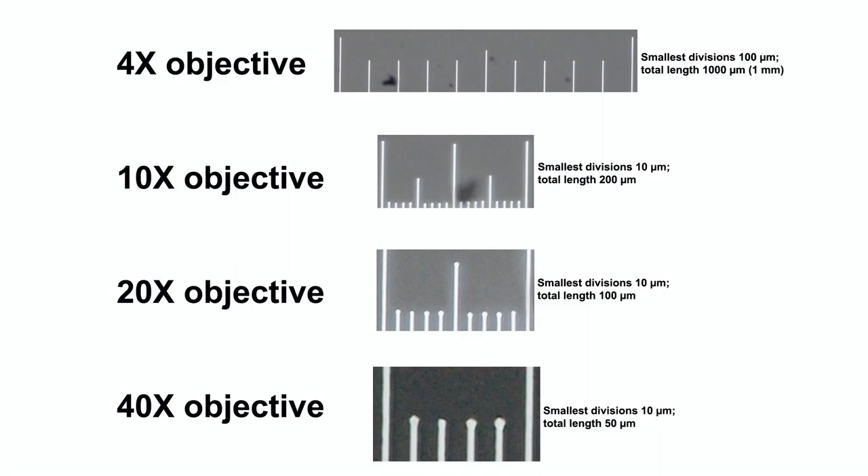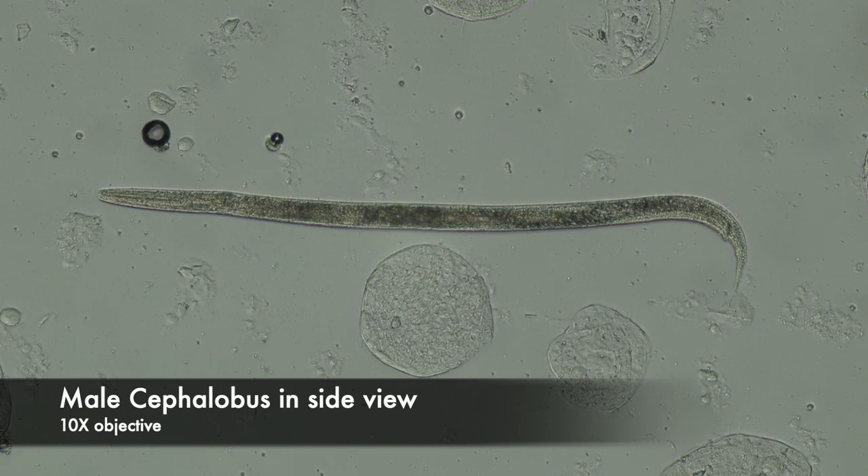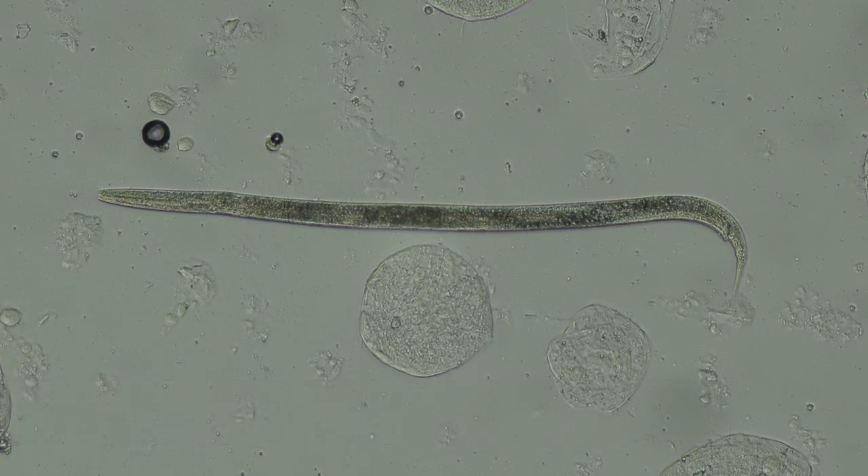To see their anatomy a little better, I killed a few individuals by heating them up. Here's a male in side view. Males of most species of nematodes typically have a bent or hooked posterior end. They use that bend to grasp females when they're mating.